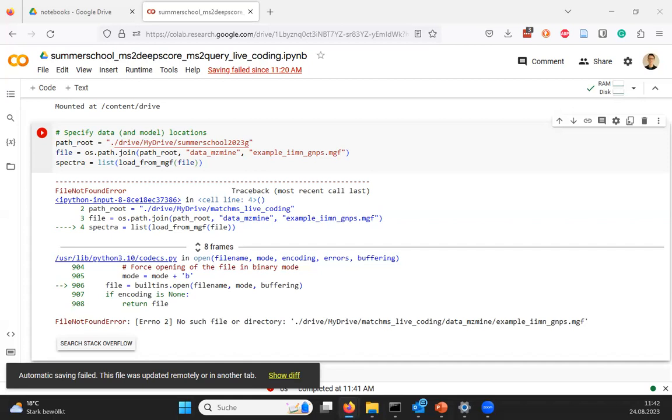In principle, quickly go through these notebooks and just execute them as long as there's no question there. I'll just see if I'm in the right one. Sorry, for me it's a different folder. You don't have to change it. It should be working as it is for you, or you change the path.